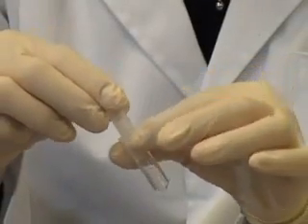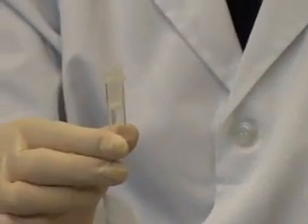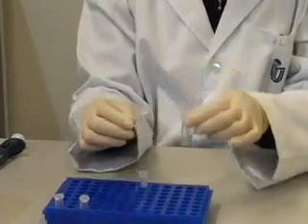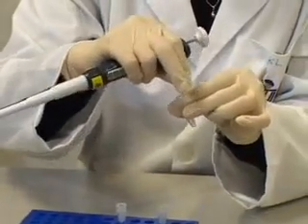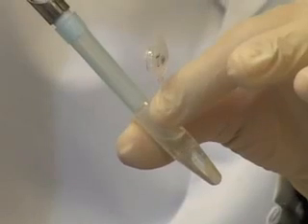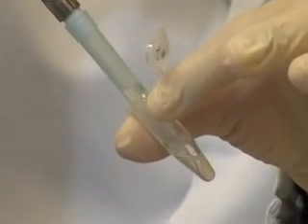Insert a wizard spin column into a 2 mL collection tube. Transfer the clear bacterial lysate into the wizard spin column. Avoid disturbing or transferring any of the white precipitate with the supernatant.